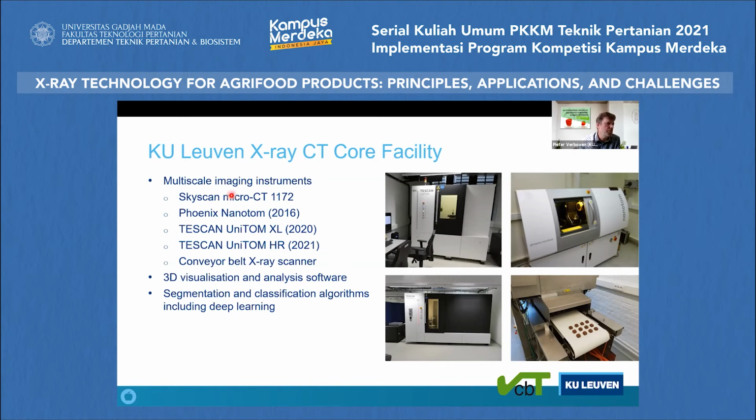It's not only tomographic imaging, because these are still standalone images. They are, I agree, quite expensive instruments as well, so they're not very useful in practice, but we also look at constructing our own machines that could be used in practice. Here is an example of an X-ray scanner that can be mounted onto a conveyor belt to do scans also in practical applications. Of course, the imaging will be of lower quality. It may not be three-dimensional, etc., but still, as I will show later, we can do interesting things with that.